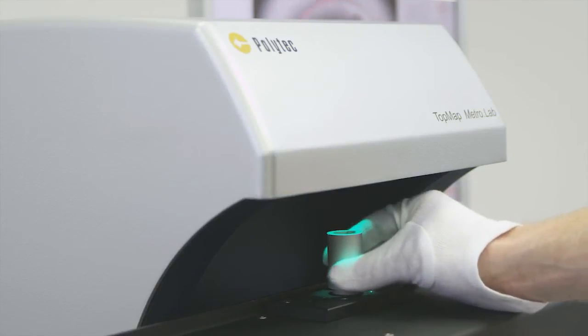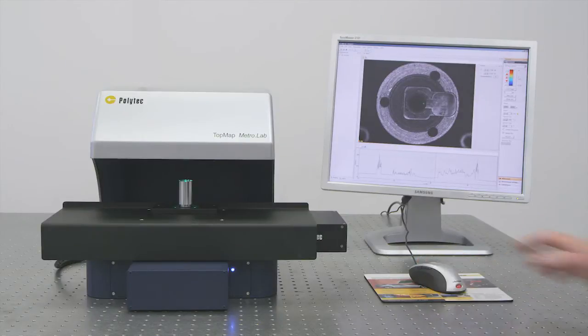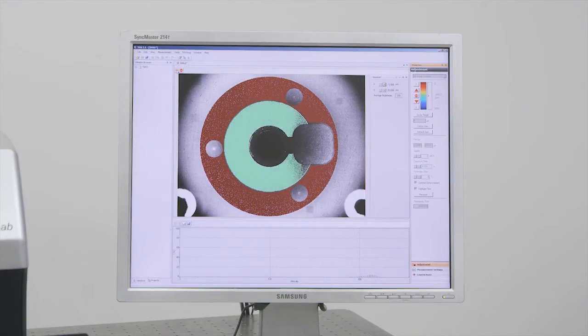To make a measurement, the sample is placed under the instrument hood. As soon as the measurement is started, the acquired sample points are drawn onto the video image in the measurement window. The time for routine measurements can be optimized down to a few seconds.